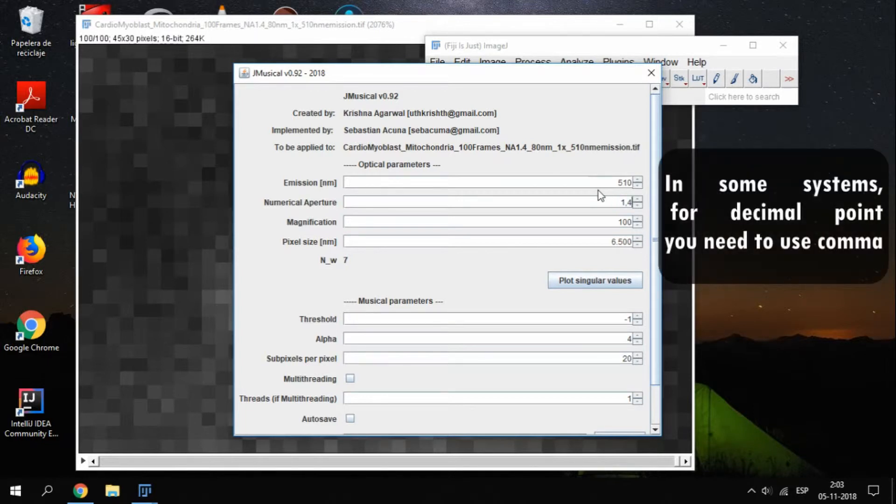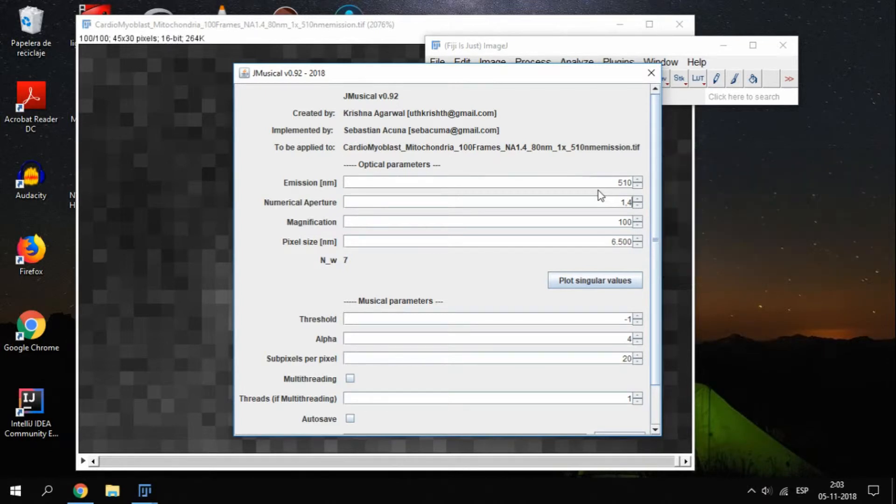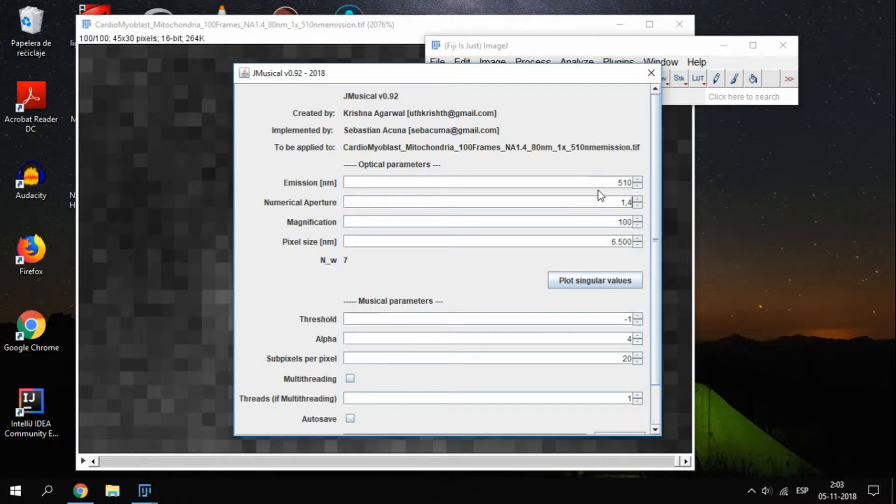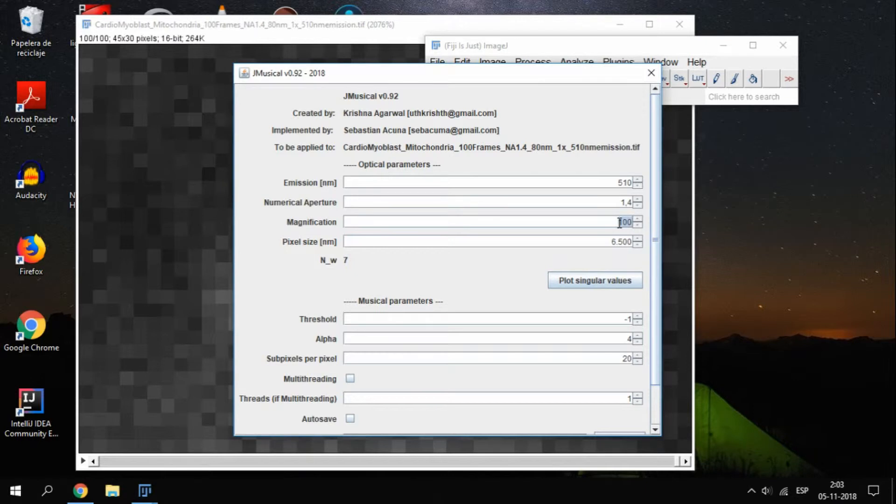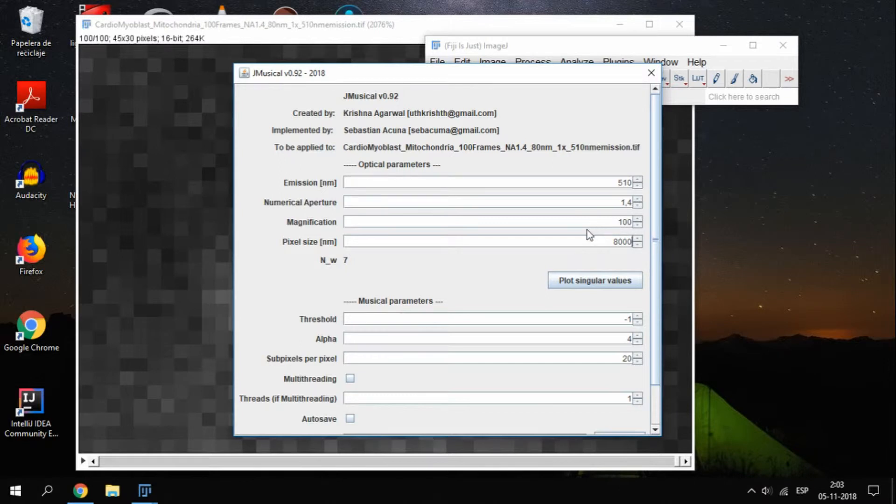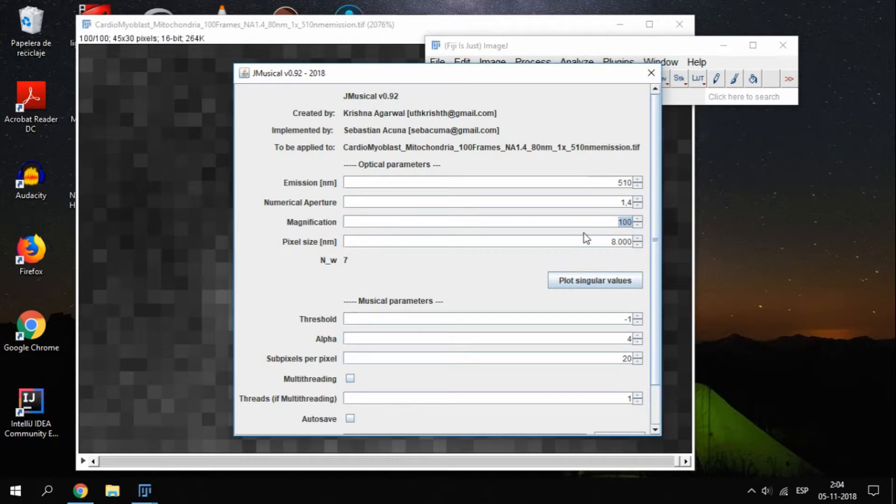For the magnification and the pixel size, we have two ways of proceeding. The first one is to use the optical magnification of your microscope and the size of the camera's pixel, which you can find on the datasheet of your camera. In our case, these parameters are 100x and 8000 nanometers. The second option is to use just the image pixel size, if you have it. In which case, we set the magnification to 1. This is the path this tutorial will follow, and the result will not be affected by this decision.